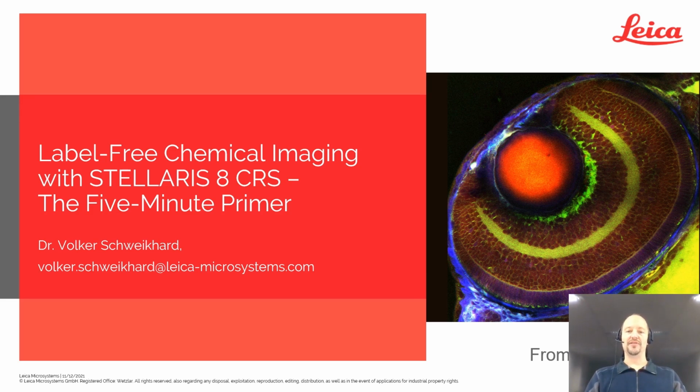I'm going to show you what this new way of doing label-free chemical imaging can do for your research. And all of that in just 5 minutes. So let's get started.